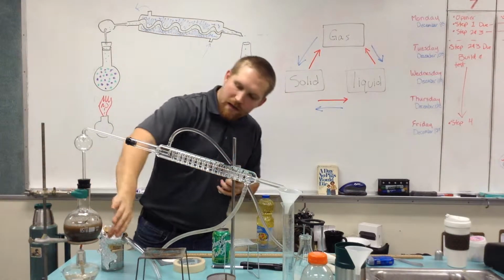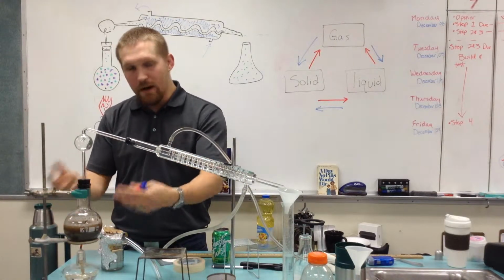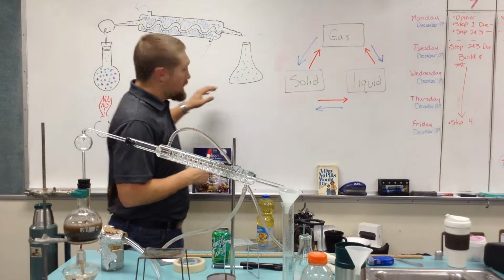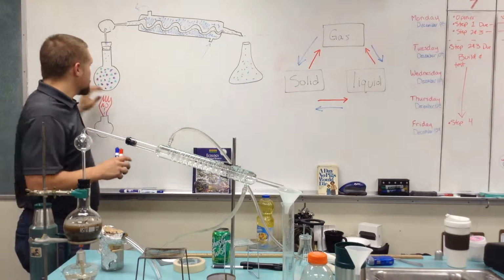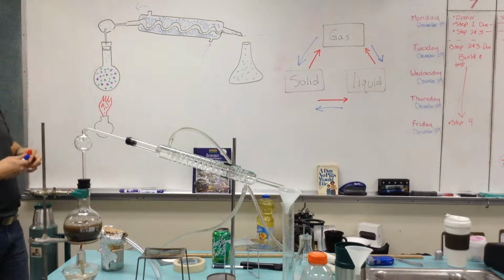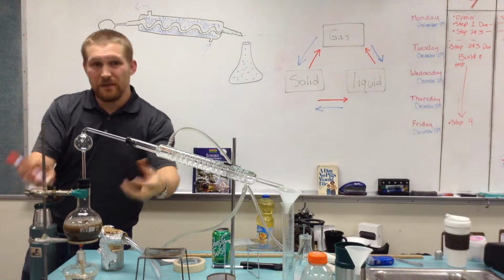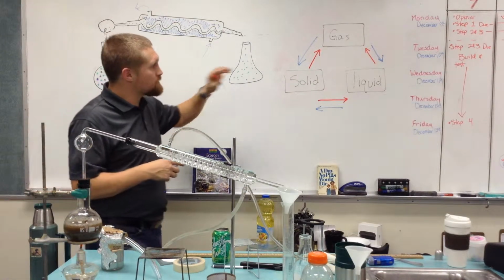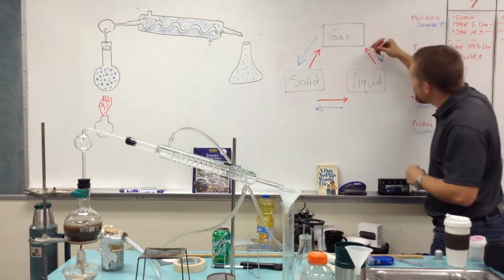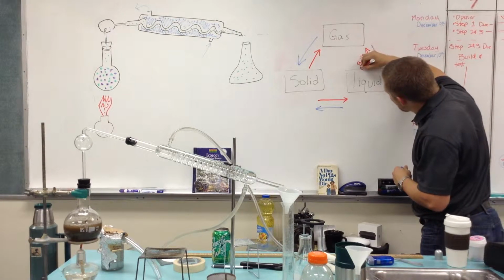Okay? At that point, and you can't see it because it's a gas, but you can see that this liquid is boiling. It's bubbling up. So it has hit its boiling point. Alright? And this liquid's made out of several different particles. But up here, I've just used two different colors to represent the different particles. So we can see that this is boiling. So something has reached its boiling point, which is where something goes from being a liquid to being a gas. So we add heat, we add energy to a liquid, and it boils or evaporates.